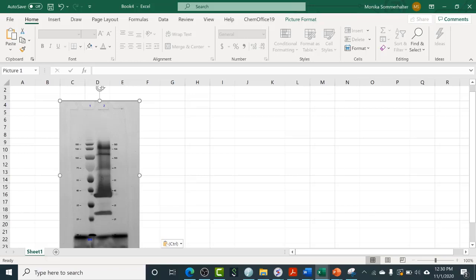This gel was stained with catechol, a simpler version of a diphenolic compound. I also used dopamine and 4-methylcatechol, but the catechol stain gave the best resolution. In lane 1 of this cutout piece of a larger gel, you see the protein standard or protein marker. For the protein marker, we know the molecular masses. These numbers should all be given in kilodalton, ranging from 180 to the very bottom, 15 kilodalton.